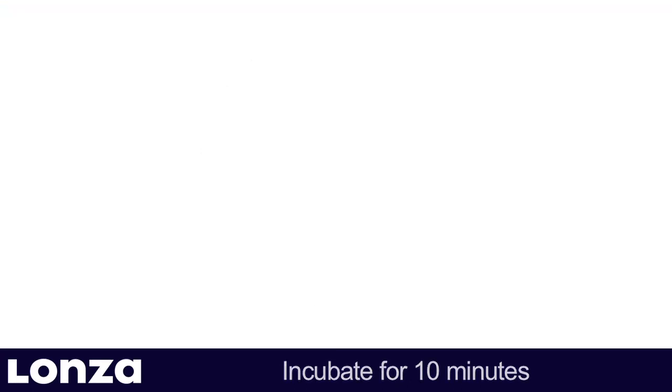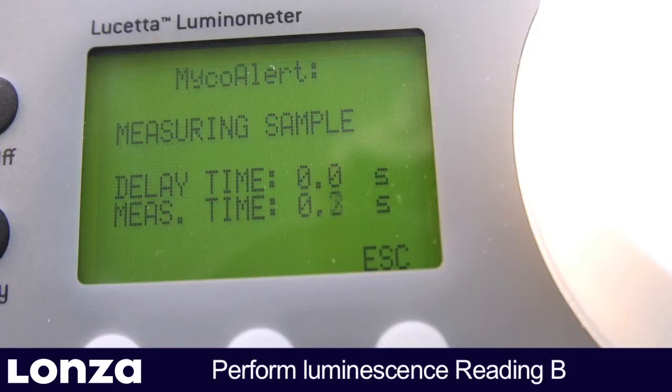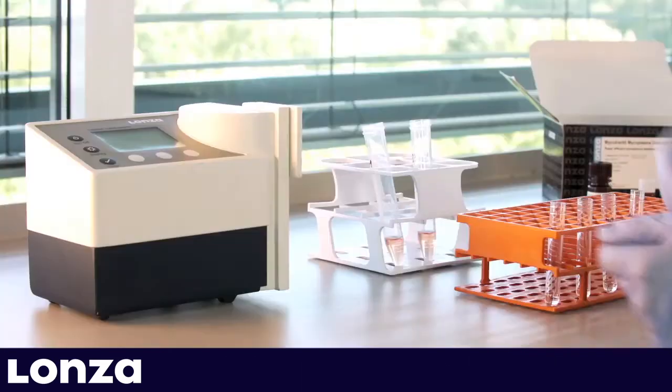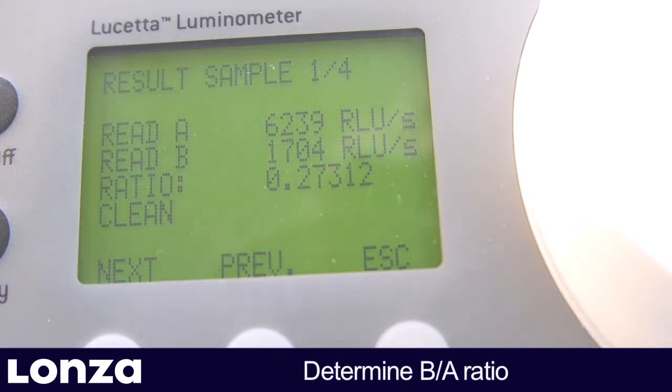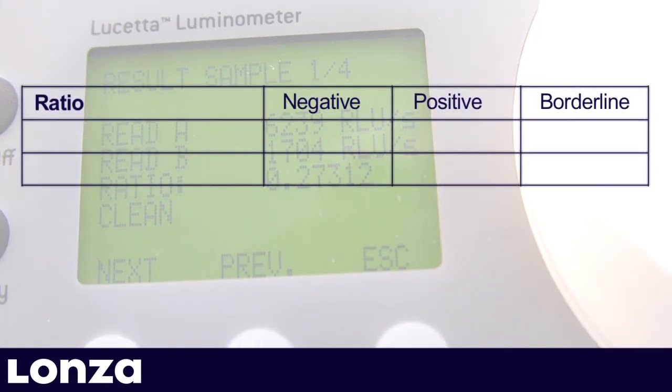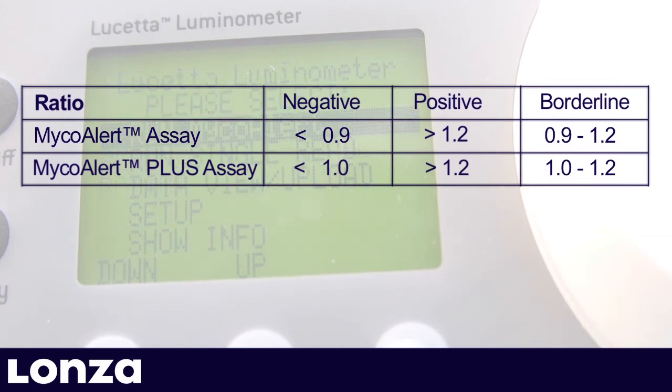For measuring a potential rise in ATP levels due to mycoplasmic enzyme activity, insert sample tubes into luminometer and perform luminescence reading B for all samples. The ratio of reading B to reading A is now used to determine whether the cell culture is contaminated by mycoplasma. If the ratio is below 0.9 or 1, depending on the MycoAlert version, your sample is negative for mycoplasma. If the ratio is above 1.2, your sample is positive for mycoplasma. A ratio in between is a borderline ratio which may indicate a very low contamination but could also be an artificial result driven by the sample matrix. In that case, retest your culture after 24 to 48 hours.